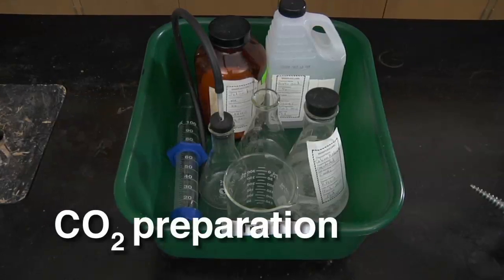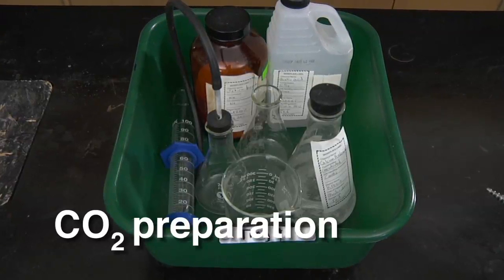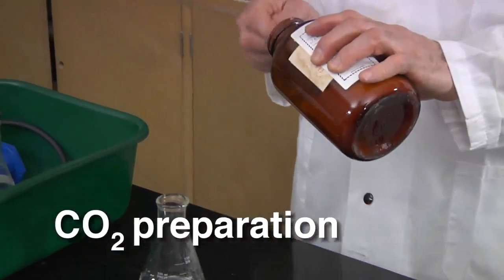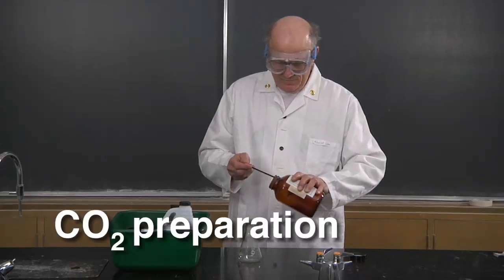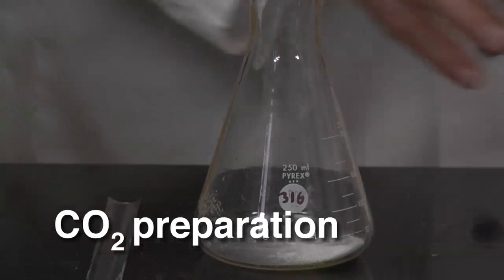There are two possible tests for the product gas, carbon dioxide. Both will be shown here. Use a clean, dry spatula to put sodium bicarbonate into the clean 250 milliliter Erlenmeyer flask. About 1/4 of a spatula is sufficient.